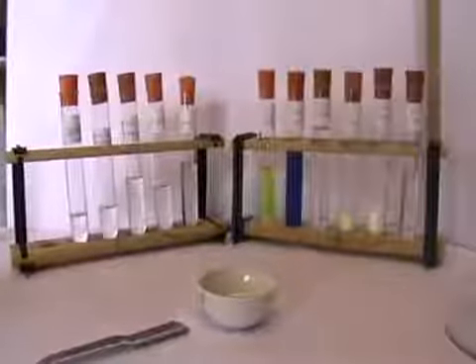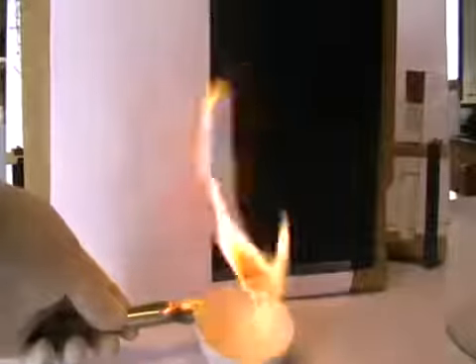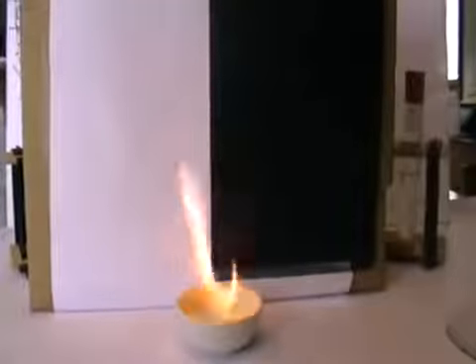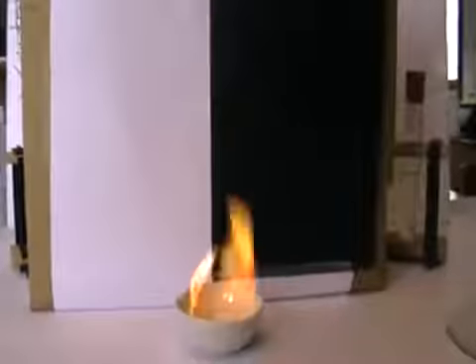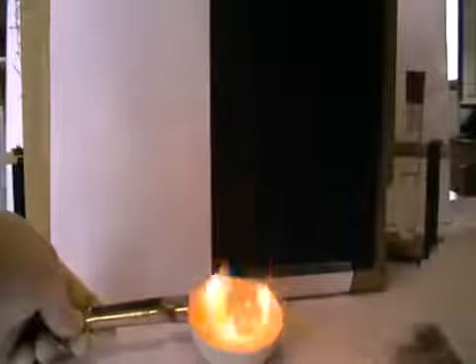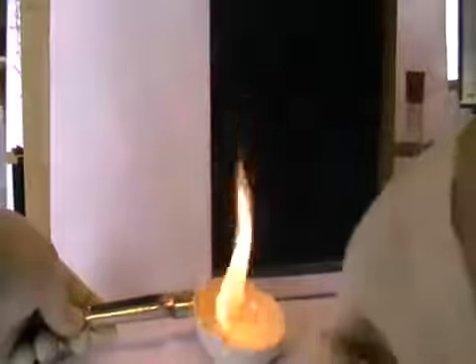Using a lighted splint, we'll see if it ignites. And it ignites immediately, as you see. Burning once again with this yellow flame or yellow-orange flame. Burning with what I would describe as, again, a relatively clean flame. Not very much in the way of a black deposit inside either, just a little bit perhaps.